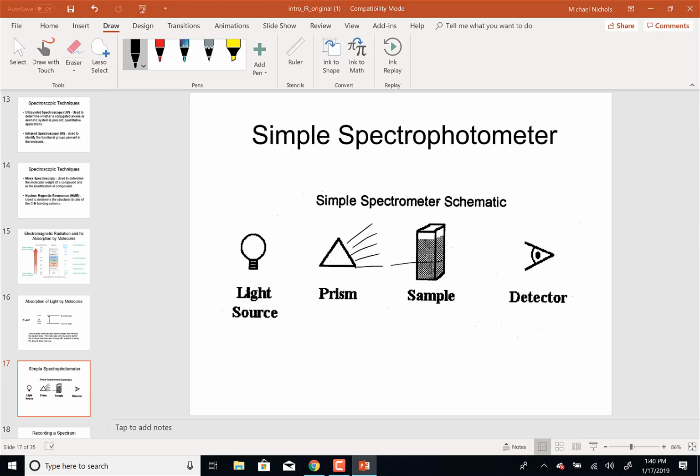And so what we're going to do is different than what you do in general chemistry. In general chemistry you do this, but you're measuring the intensity of the light that you're changing over to absorbance. What we're going to do is actually measure the intensity or the absorbance of the sample and plot it according to the frequency. So we're going to make a spectrum out of that.